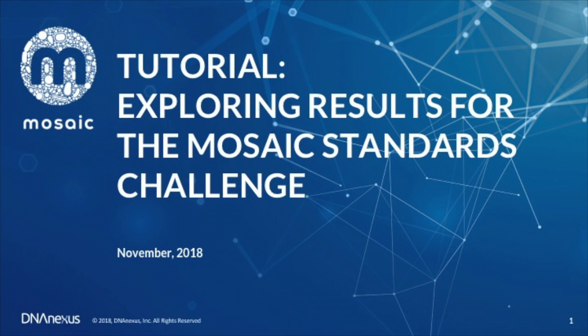Hello, my name is Sam Westrake, and this is the third tutorial video for the Standards Challenge on Mosaic. In this video, I will show you how to explore the results of the sequencing data and the protocol metadata that you've provided for the Standards Challenge.